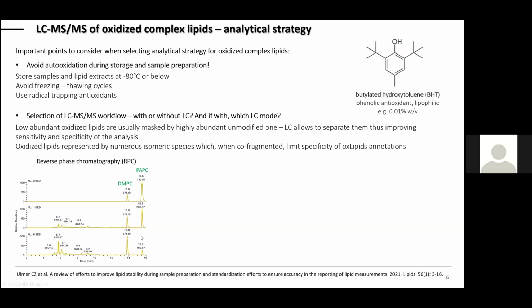And this is just an example here, the standard lipid PAPC oxidized for different time points. And you can see that with the different points of oxidation, we start to accumulate products corresponding to the oxidized species at earlier retention times, so eluting earlier from the reverse phase.